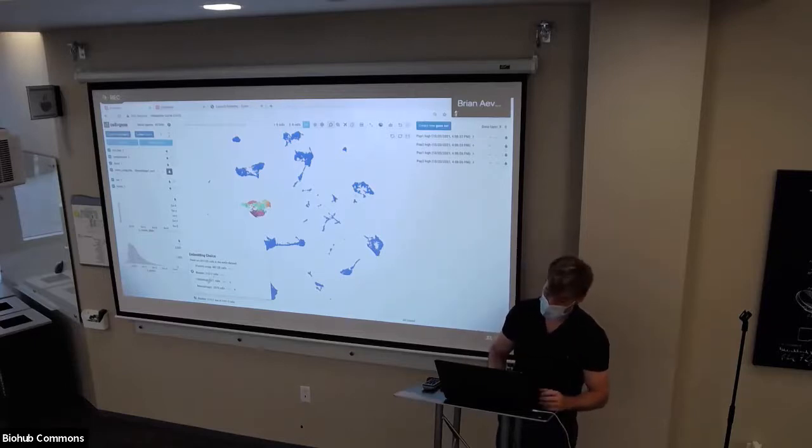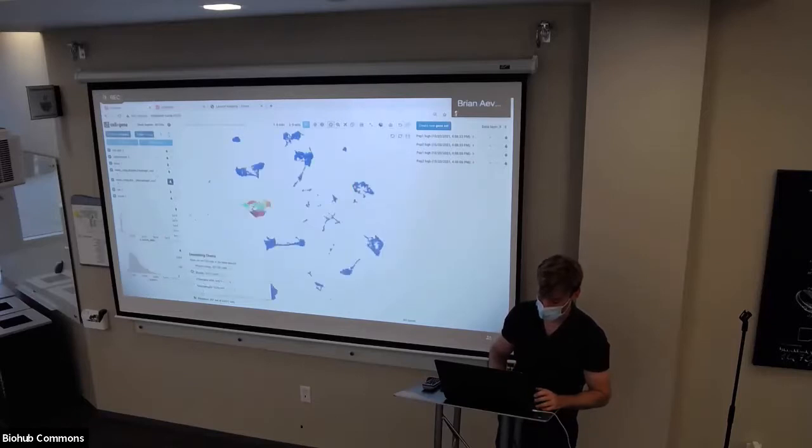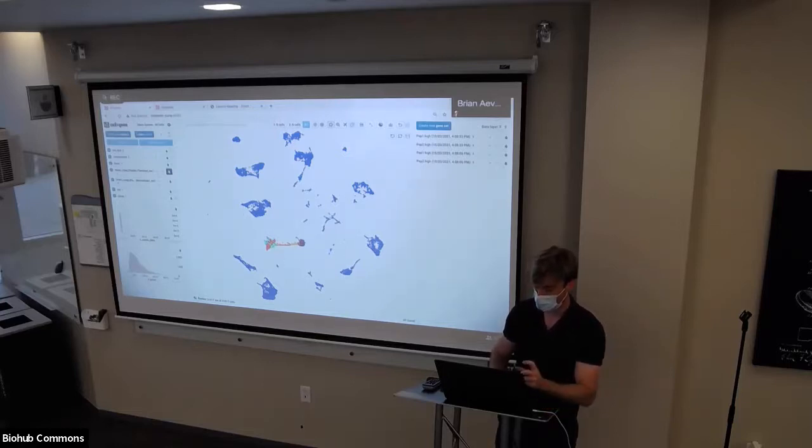Now let's say I do this for every cluster in this view. I go to the fibroblasts and I do the same thing. And here I'll just show you these two examples. Now if we open the fibroblast coloring, we see, okay, cool, we've been able to subcluster with quite a great view. But you'll notice that everything else is invisible because we only clustered in the fibroblast view.